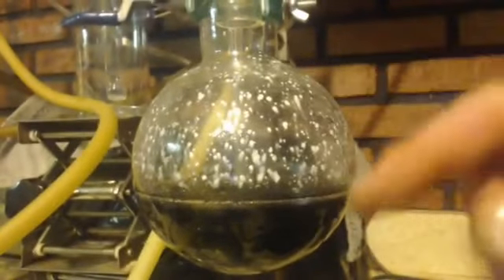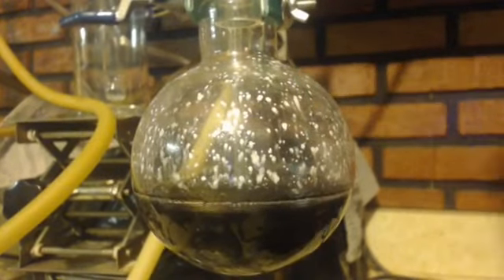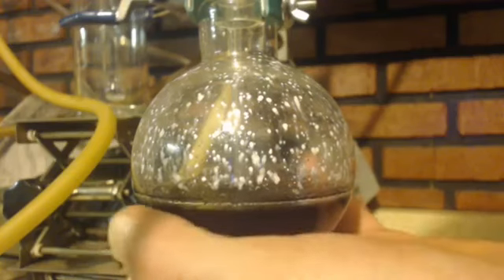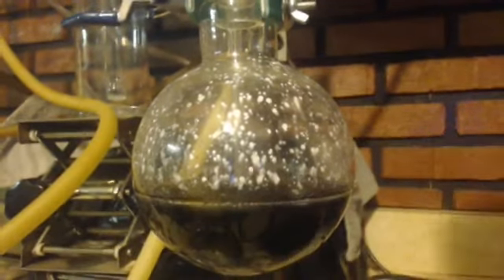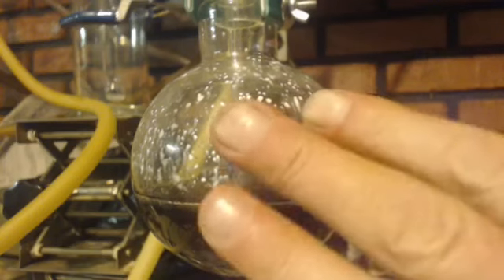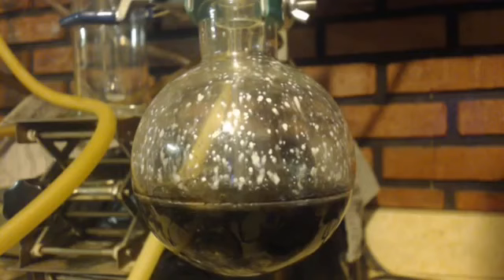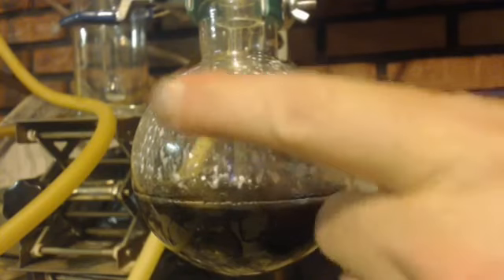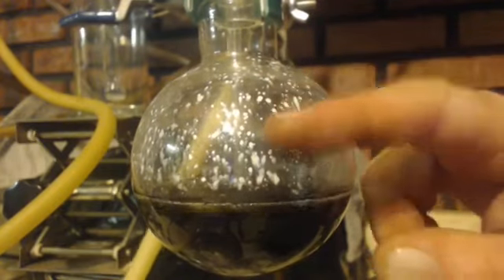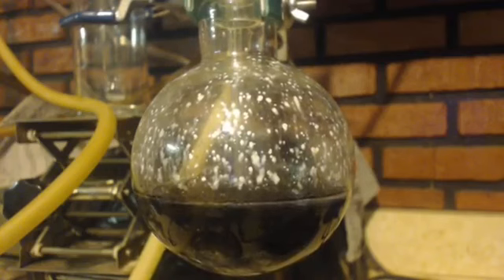I'm guessing, I don't know for sure, but because it's white, I don't think it's the magnesium. I think it's the tetrahedral intermediate salt that is formed. And so that's a good thing, I think, because that's my product. And then when I do my workup and quench it, it'll turn that salt into the acid that I want, propanoic acid. But I thought it was interesting how there's white stuff here and I'm making a salt, so I'm hoping that's the salt.